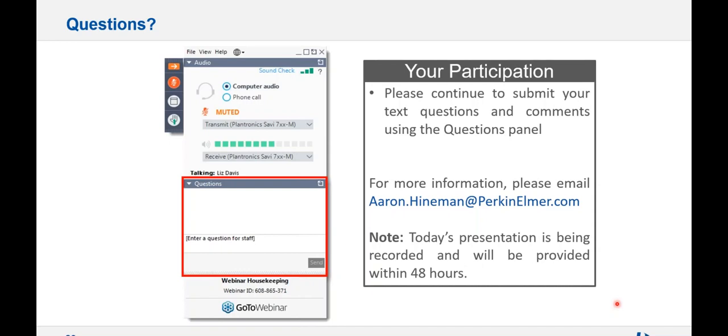Another thing that could be happening, from my experience, is just the whole system is more contaminated somehow. So something got contaminated. Another way, as Sarah said, those matrix modifiers are selected for their ultra high purity. I've seen some get contaminated by just sitting out in the lab. Somehow they got contaminated after opening them. So you may want to procure another one if that one for some reason got contaminated. So I have seen that.